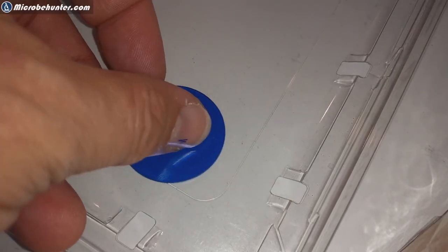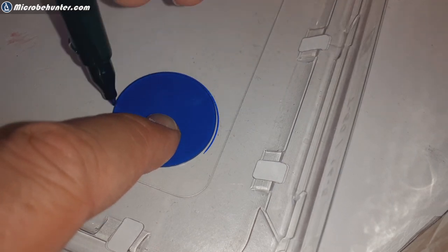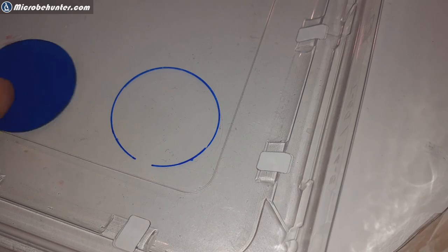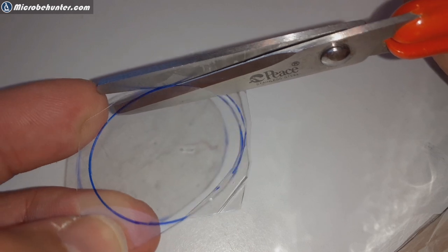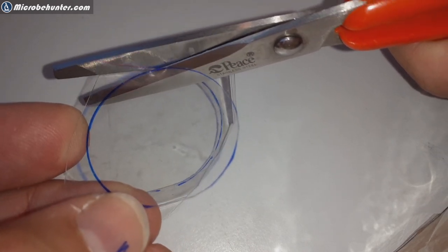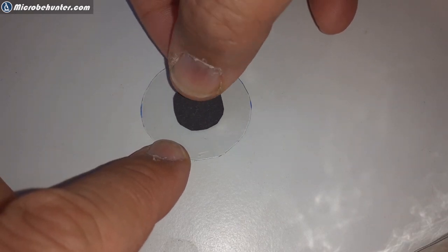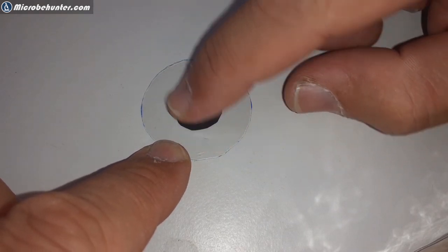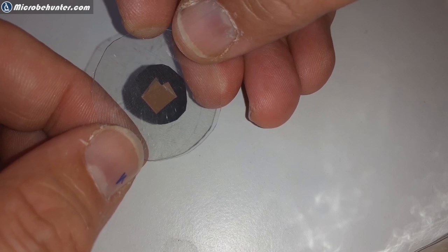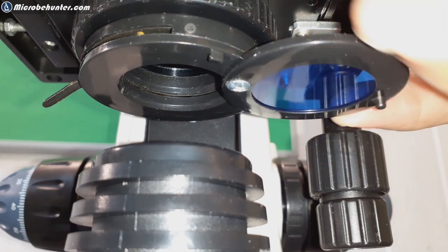Well, the simplest way to make a dark field patch stop filter is simply to cut out some clear plastic, in this case from plastic packaging material. Diameter is around 32 millimeters. Maybe make it a little bit smaller so that the filter is easier to fit into the filter holder. In the middle, I used some tape that I wrapped back on itself, and then the central disc of around 15 millimeters. Now, I found out later that maybe it's still a little bit small, so maybe 16 to 17 millimeters might actually give a darker background, especially when using the high magnification 40 times objective.